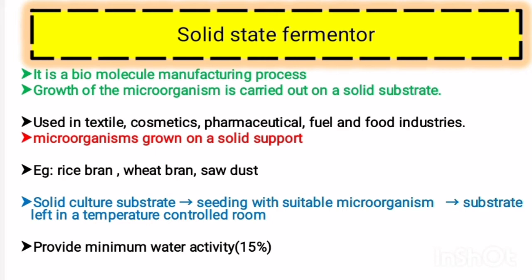Solid state fermentation is a biomolecule manufacturing process in food, pharmaceutical, cosmetic, fuel, and textile industries. The biomolecules are the metabolites generated by microorganisms, and these microorganisms are grown on a solid support.